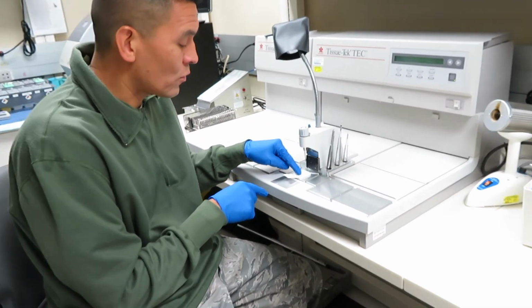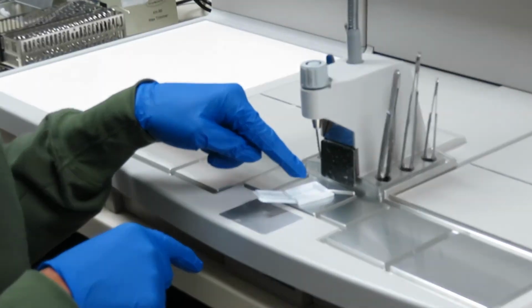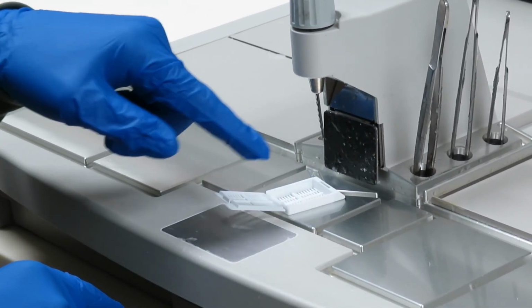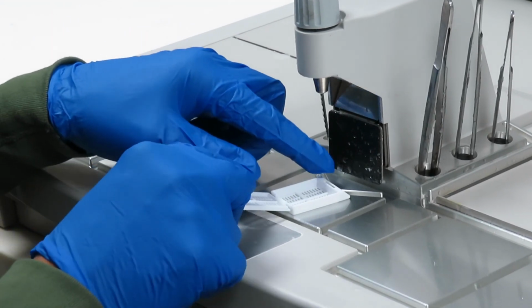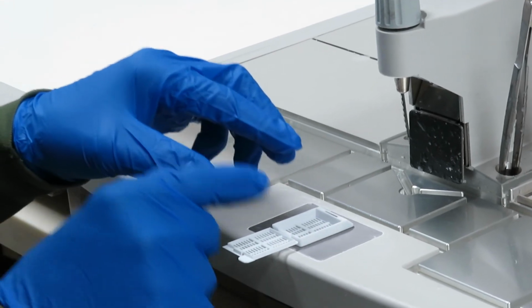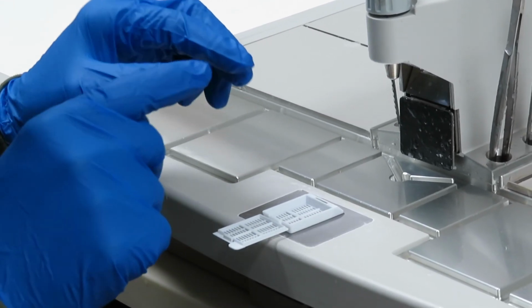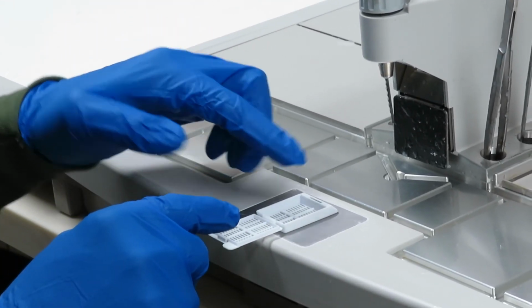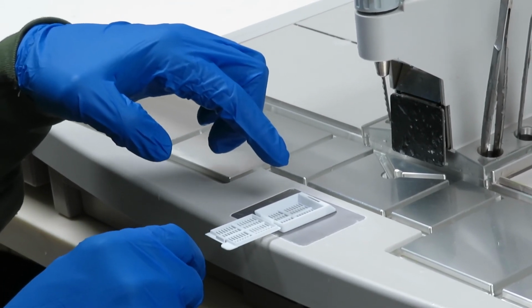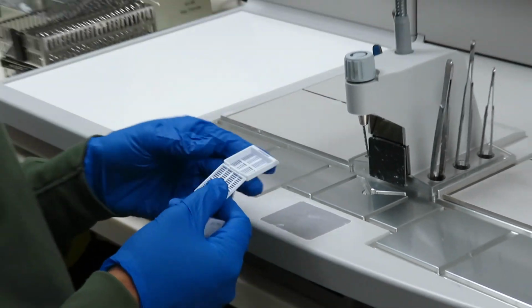And what it does is it pours in and forms kind of a pool. The tissue will be inside that little pool of liquid wax. Then as they transfer it over here, it cools down and the wax hardens into what we call a tissue block. And so the tissue is inside that solidified wax, if you will.